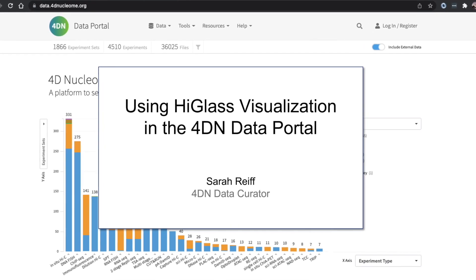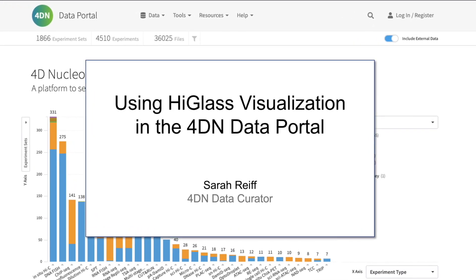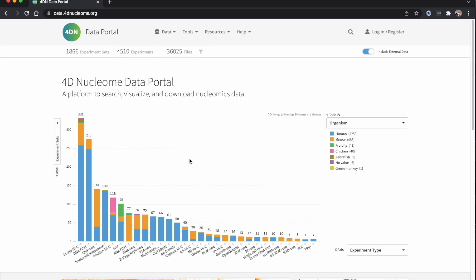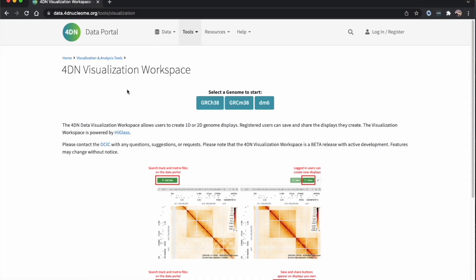In this video, I'm going to go over how to use the HiGlass visualization to compare data in the 4DN data portal. We start out at data.4dnucleome.org, and then we can go to the tools menu and click on 4DN visualization workspace.